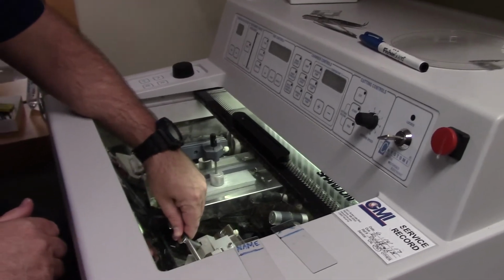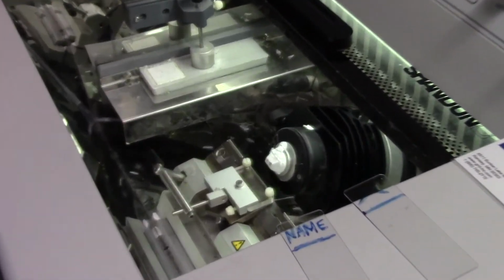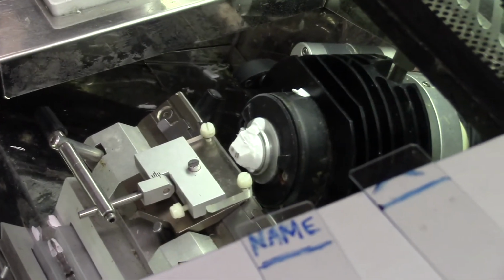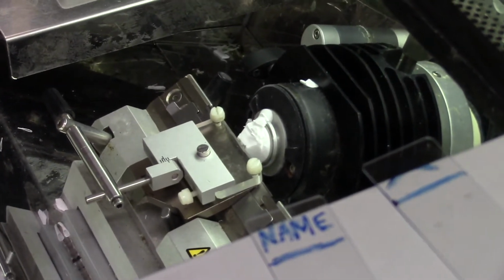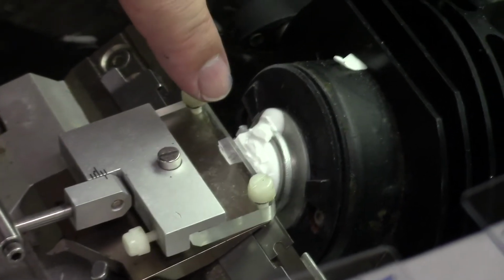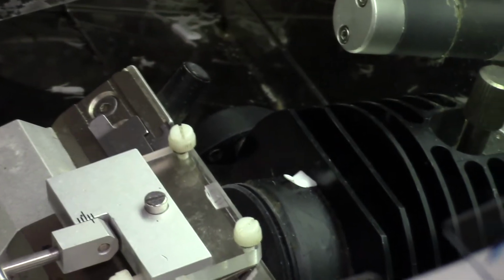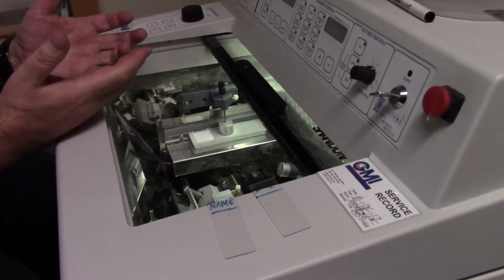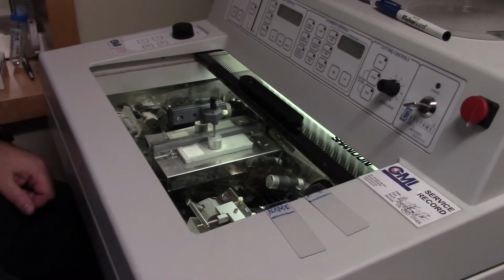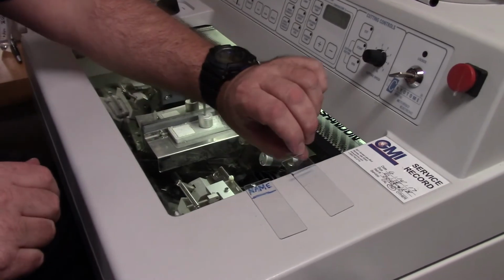So now I'll put the roll guard back down. I'll grab the wheel, and it goes up, moves 20 microns forward, and slowly down, down, down, and you can see the next piece of tissue slide right under the roll guard. So it took some fine maneuvering of me to get this glass roll guard in the exact right place. But now, all I had to do was roll the wheel, and it made two perfect sections.